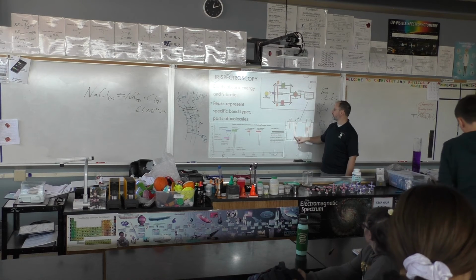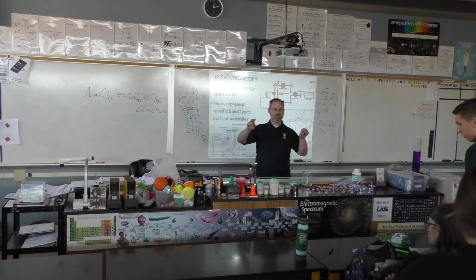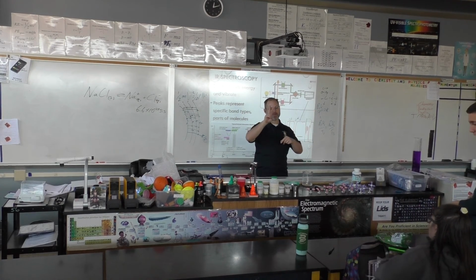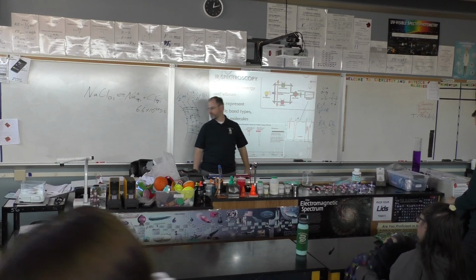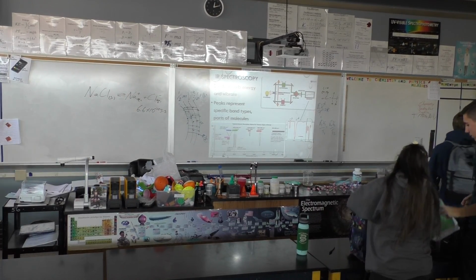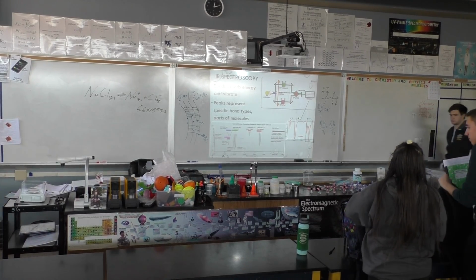And I got a very pronounced this, but nothing here. So you're like, I know it's in this range. I'm going to kill this one, this one, this one. That gives me 4 options. I'll kill this one, give me 2 options. I'll kill this one, 7. Which is why I would love to have an infrared spectrophotometer on campus.